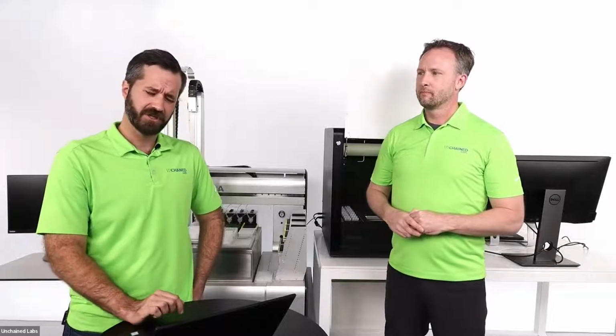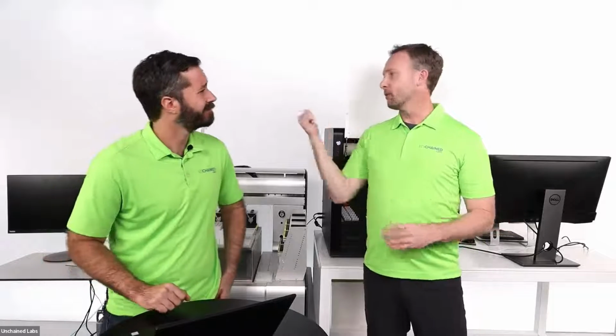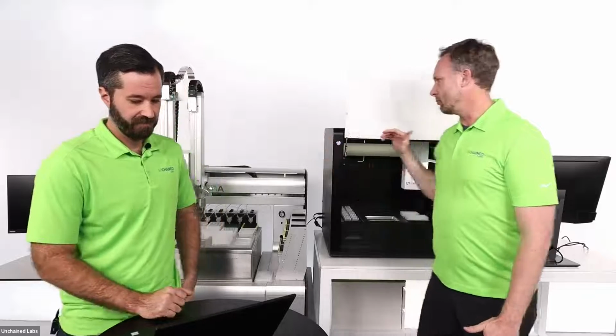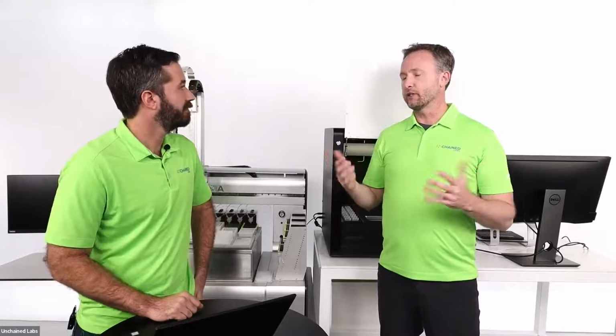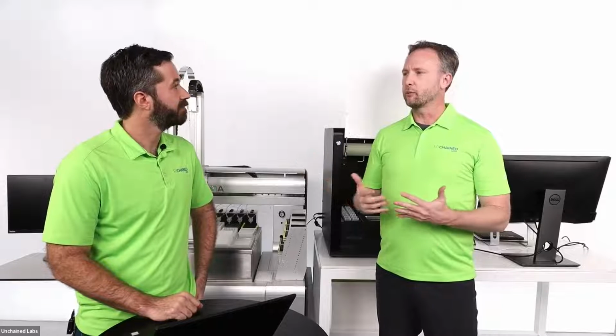Okay. All right. I'm not sure I understand this question quite. What kind of pipette channels are used? Oh, okay, so maybe the pipetting technology. They're both essentially air pipetting, which has many different benefits. The Big Tuna uses liquid displaced air pipetting, and on Unagi, the little guy behind me, it is just straight piston-driven air displaced pipetting technology. But essentially, they're both air displaced pipetting, which means that there's no system fluid that comes in contact with it. I see. Okay, that makes sense.